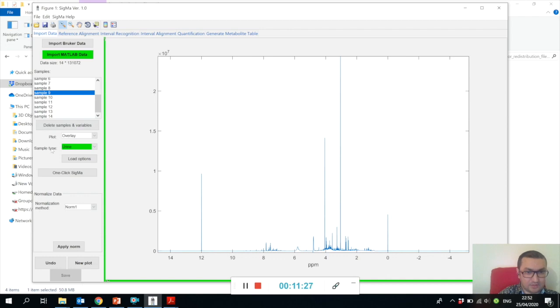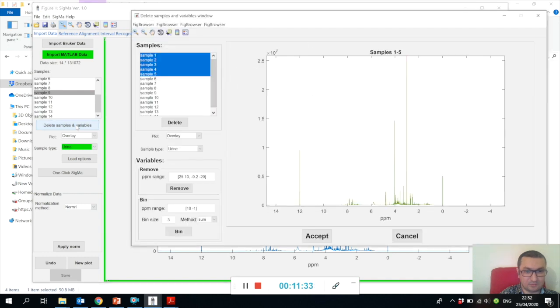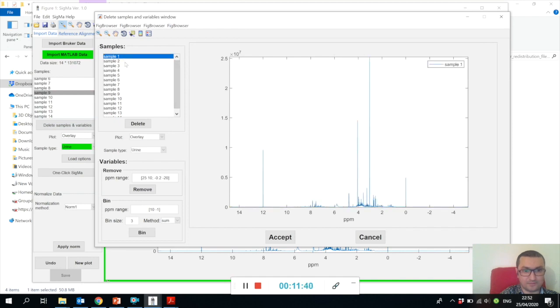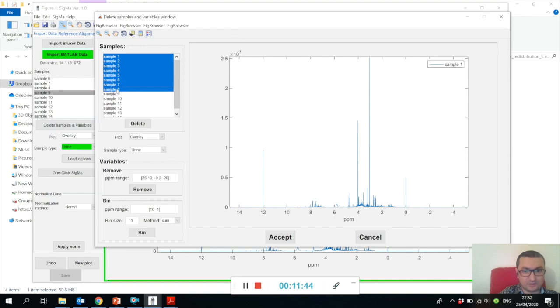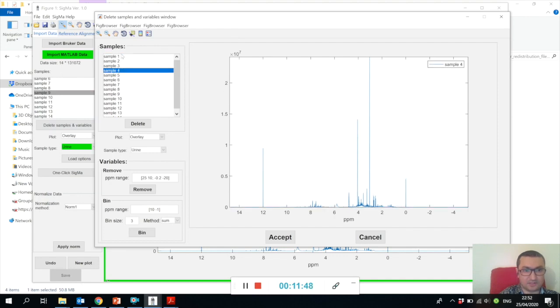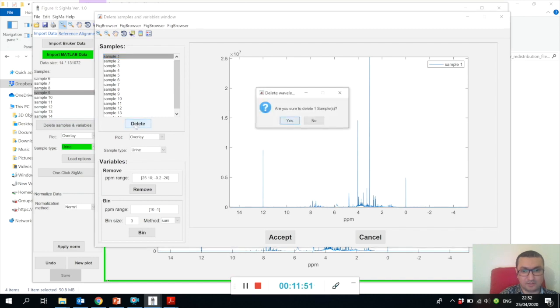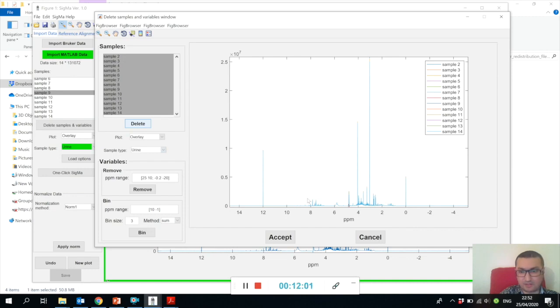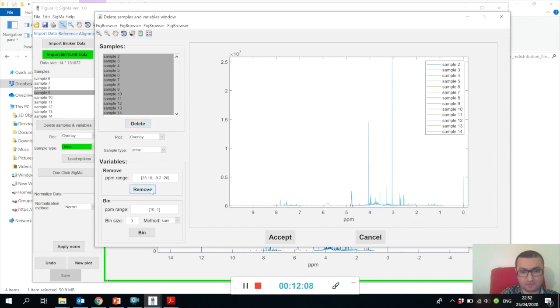Now we know how to import the NMR spectra. Here you see these buttons called Delete Samples and Variables. If you press this, it will open a separate window where you can select which sample you want to be deleted. You just need to select those samples and press delete. Let me delete sample number one. It asks 'Are you sure?' - yes, we're sure. Now we deleted sample number one.